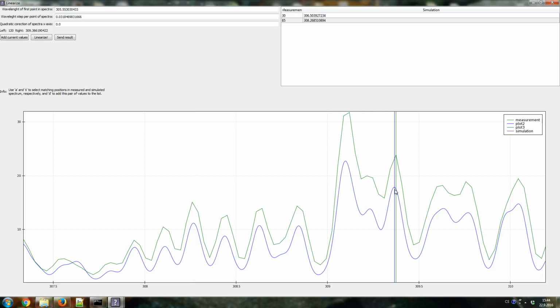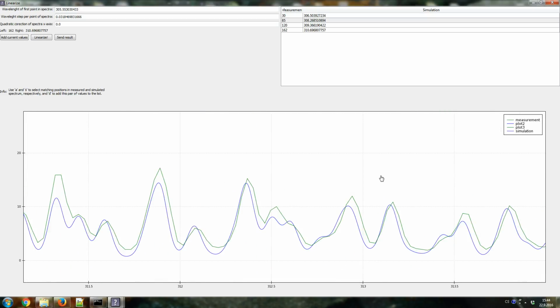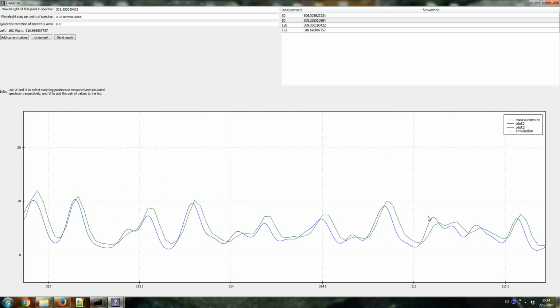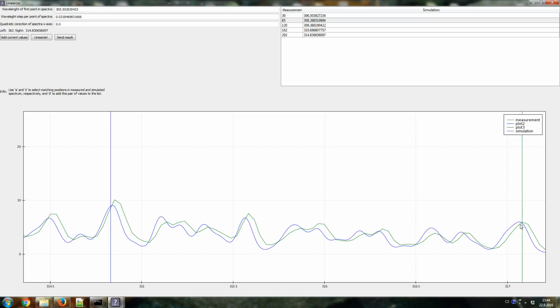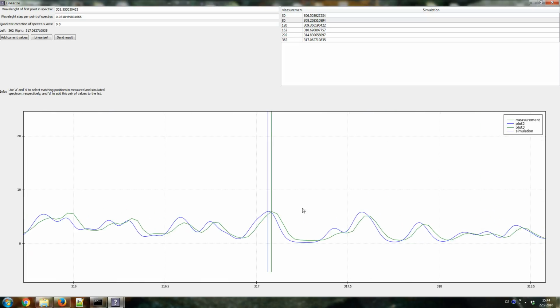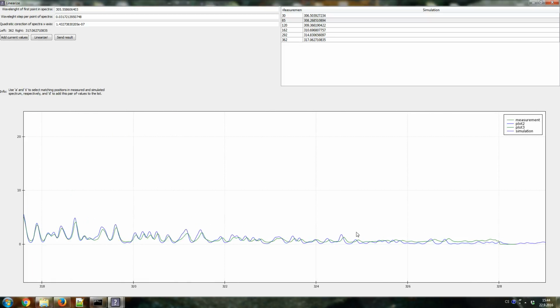Okay, so S, D, and again A, S, D, and if we go to higher wavelengths, we see that now it's getting worse, so I have to correct more and more. And okay, let's do it like that, and let's see if we can be satisfied with that. We just press the linearize button and see what happens. So now it's recalculated and it's slightly better.